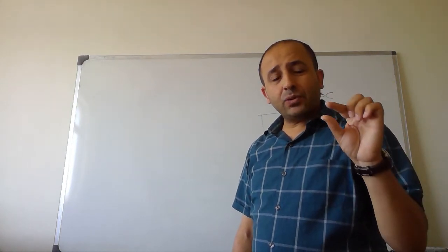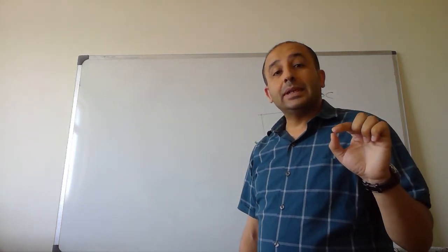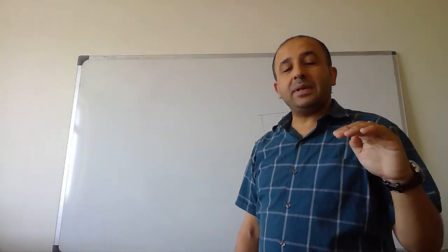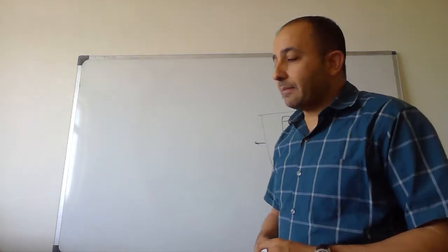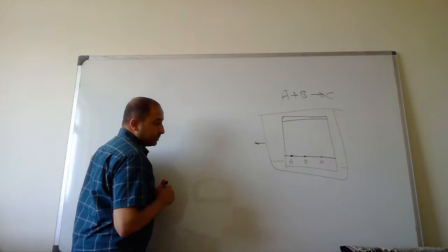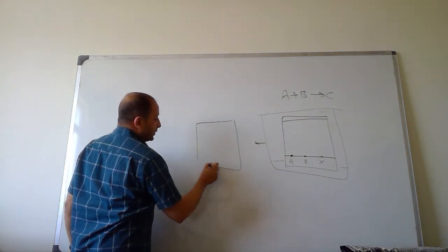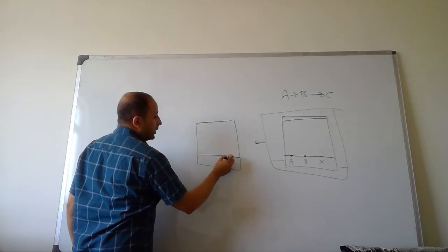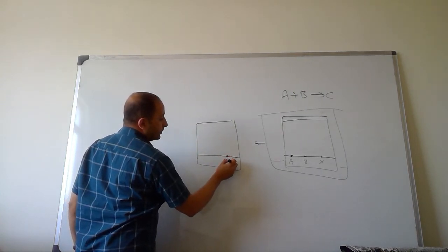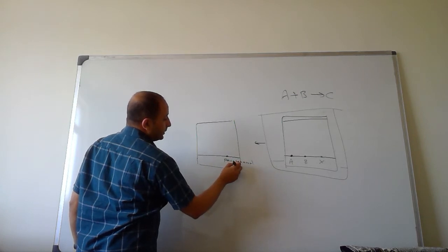So we have to have para-aminophenol in a very low amount, within a certain limit, in paracetamol. For example, if we have a paracetamol suspension, we can dilute this suspension to a certain extent, and here we have paracetamol suspension.